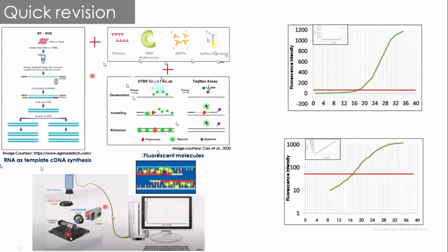Now we will closely look at how this curve looks. In the regular curve, you will see that you have exponential as well as non-exponential forms, which we will be discussing in the next slide. However, in order to check the real-time amplification, it is important to convert the y-axis into the logarithmic scale, and that enhances our visibility to notice the threshold value.